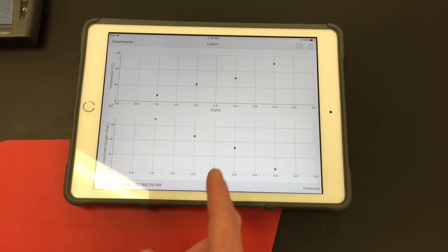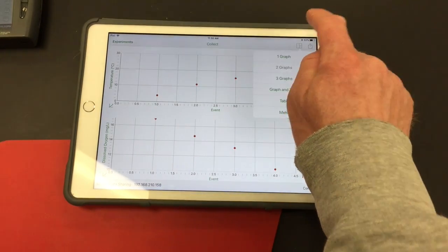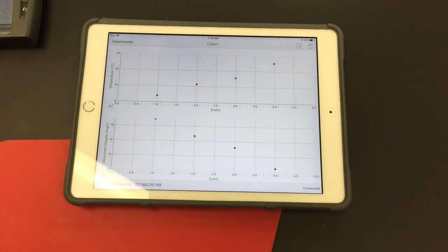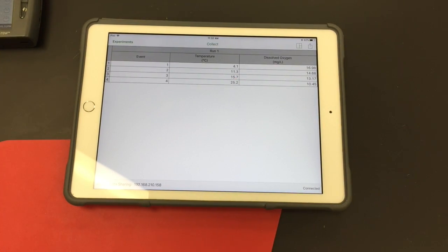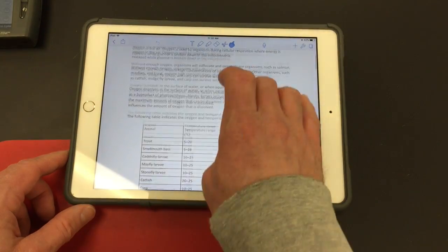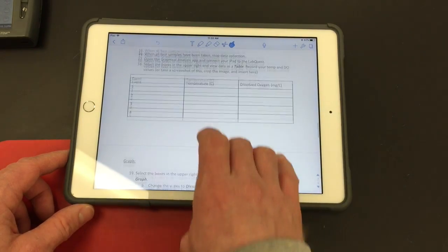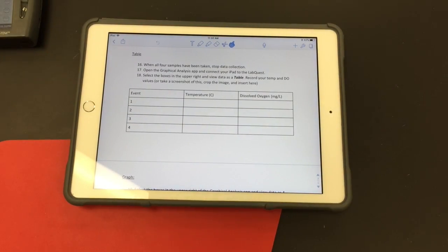Okay, so I'm going to actually want to change the way this is set up. The first thing I'm going to do for my write-up is obtain this as a table. So then I can either screenshot this or write and transfer those data points into the data table that the write-up calls for.